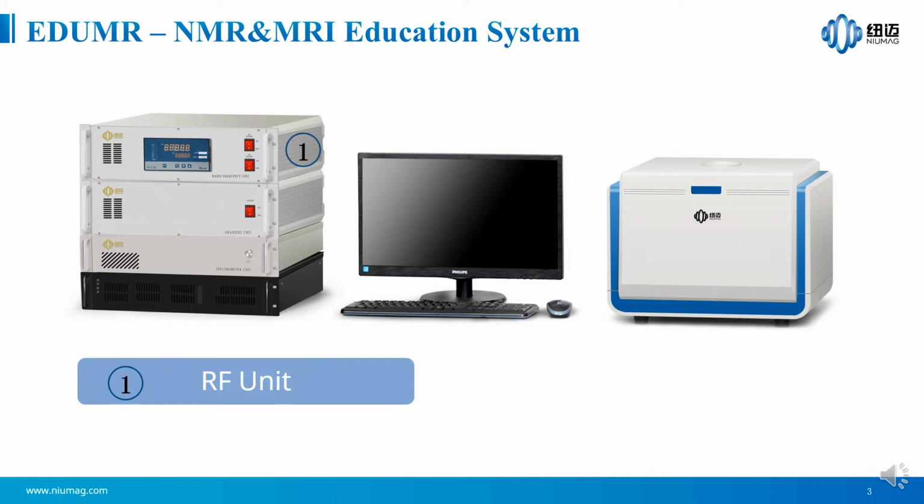Previously I introduced the classification of NMR. Today, I will focus on this benchtop NMR instrument. This is the education NMR. We call that the EDU-MR series, the analyzer of NMR or MRI. I used a previous version of this when I was in school. It's basically the same structure. It's been around for a long time.